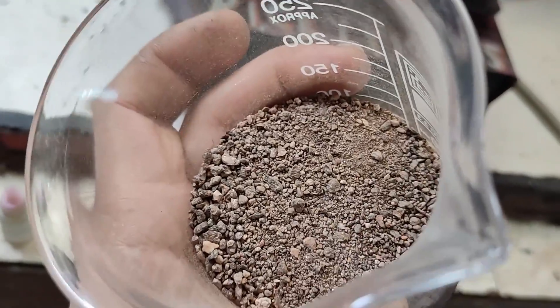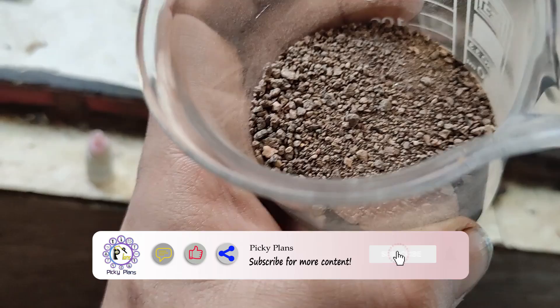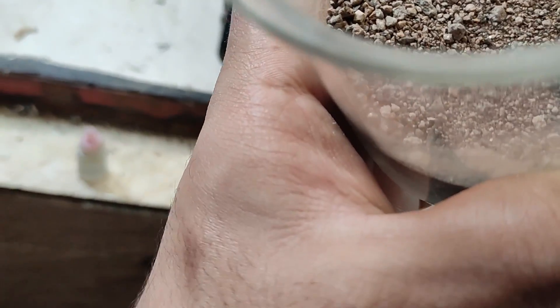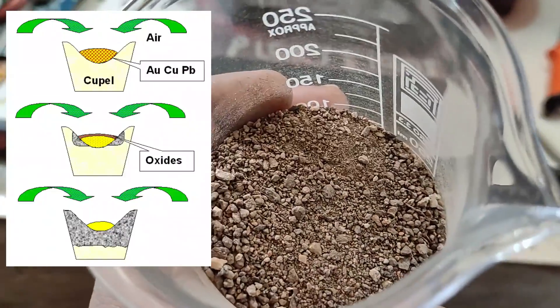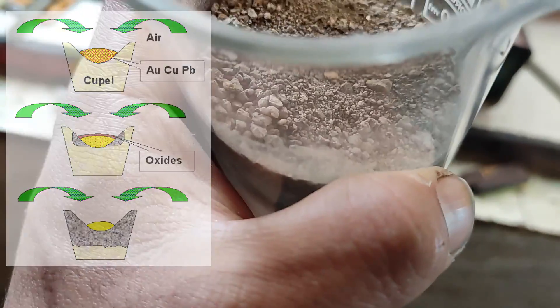Hello my friends, welcome back to PQPlans Lab. Here I have a sample of crushed gold ore. The best way to process this material is using an industrial method which involves using high temperature and lead metal to oxidize base metals and recover gold through the cupellation process.